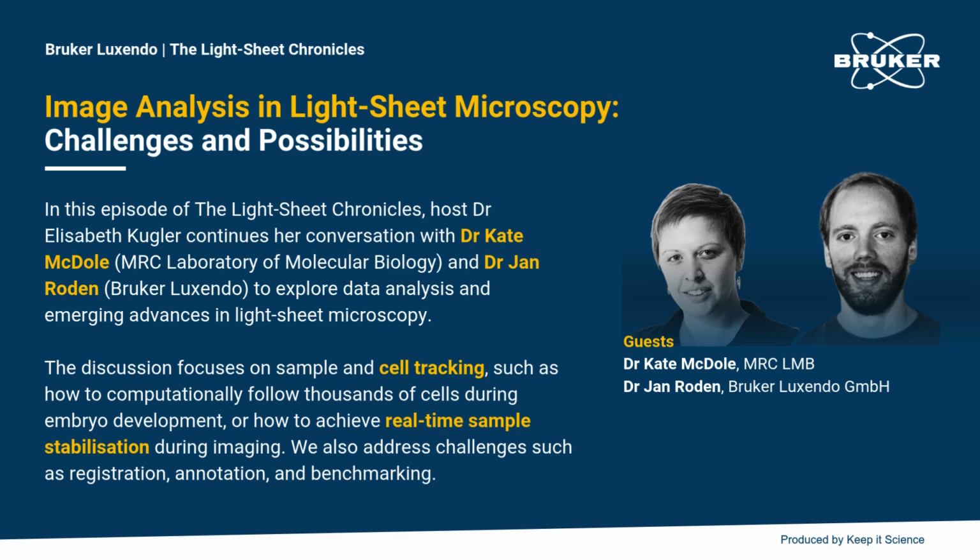Yeah, I would agree with Jan, particularly when you have samples that are sparsely labeled or there's not enough image content in the middle, it could be particularly challenging to fuse because you can't just rely on the coordinates of the sample or the stage to fuse it, especially if you're looking at fine structures.